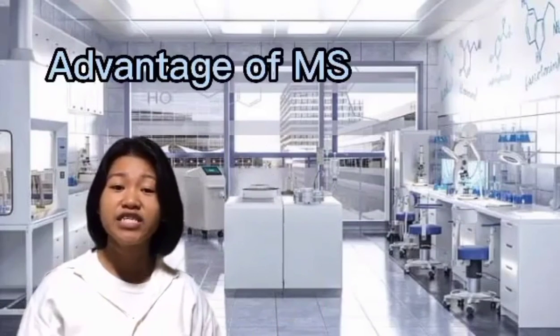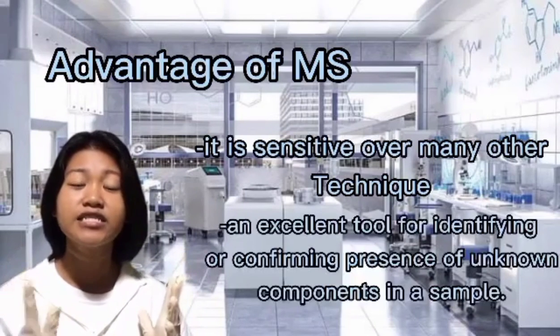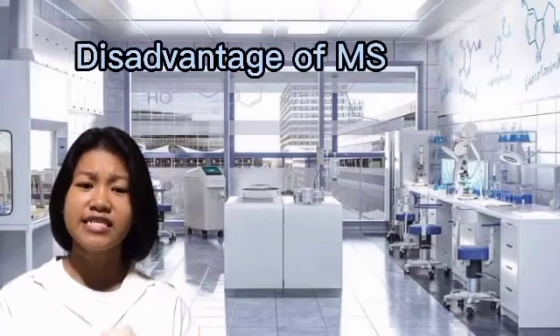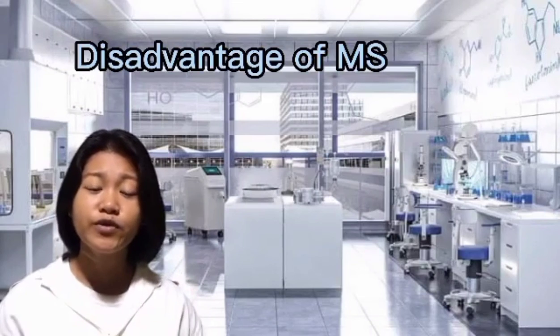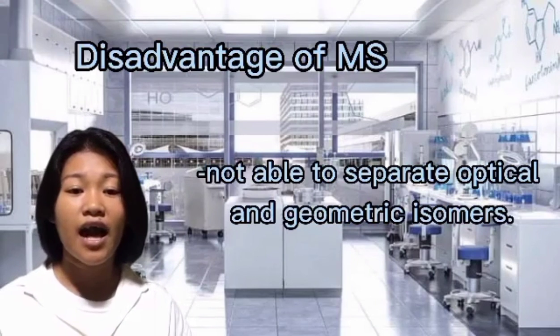If there is an advantage with mass spectroscopy, then there will also be a disadvantage. A big advantage of mass spectrometry is that it is incredibly sensitive compared to many other techniques. It is an excellent tool for identifying or confirming the presence of unknown components in a sample. The disadvantages are that identifying hydrocarbons that produce similar ions is not very good, and it is not able to separate optical and geometric isomers.